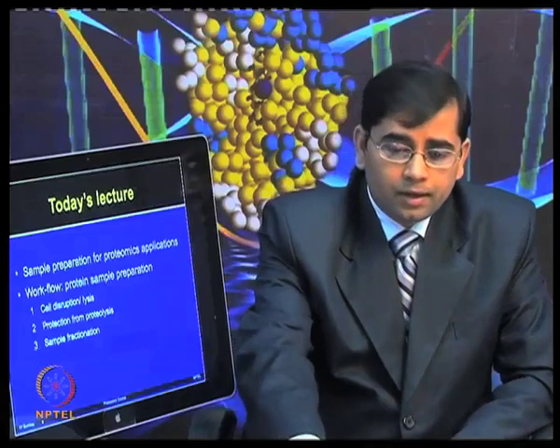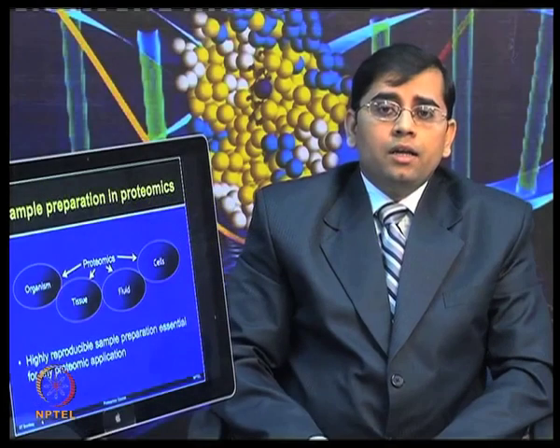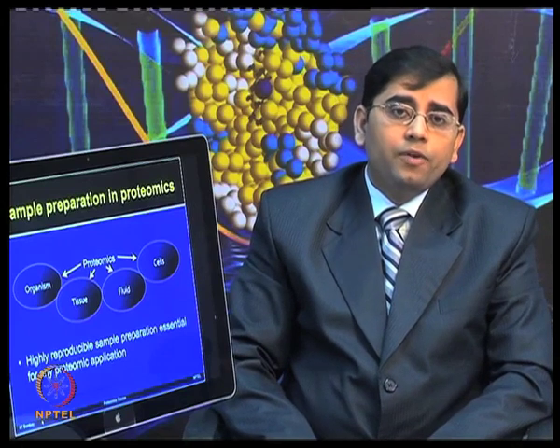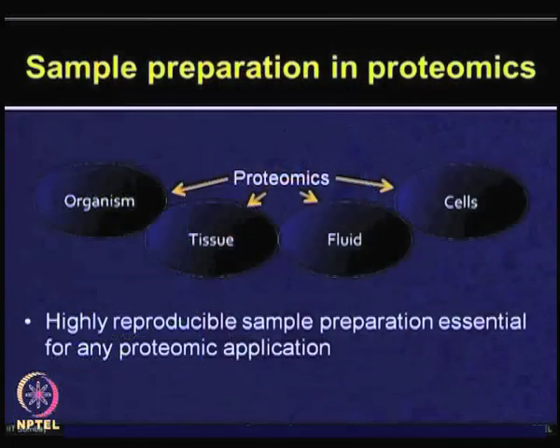So, let us start. Workflow for proteomic sample preparation. The proteome is very complex. Whether you want to perform your proteomic analysis for the whole organism, it means you want to know all the proteins present in a given organism or in a tissue or in body fluids or in different types of cells.